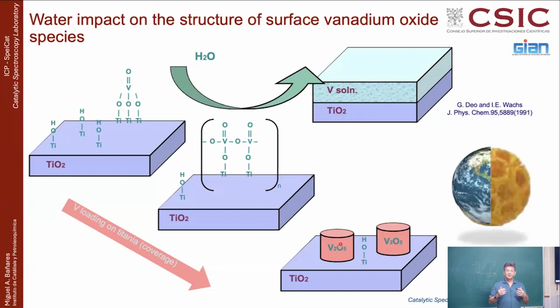And wet means that the particles, even if your sample looks like a loose, dry powder, have an ocean at the surface. It looks like a planet, like planet Earth with its layer of water. Our nanoparticles are the same. Don't think of them as something dry when you have them in your hand or in your bottle or in your vial. It's actually like an ocean. You have layers of water. You have molecular water, not hydroxyls. You have liquid water. You have an ocean at the surface.